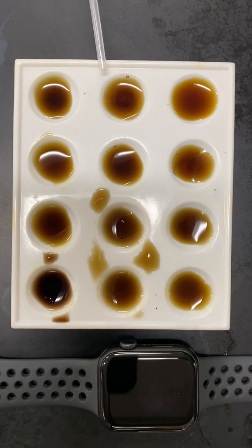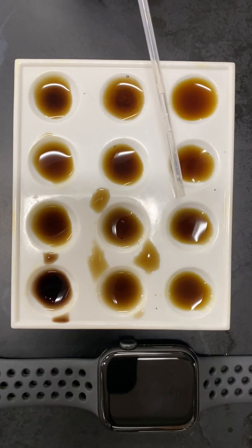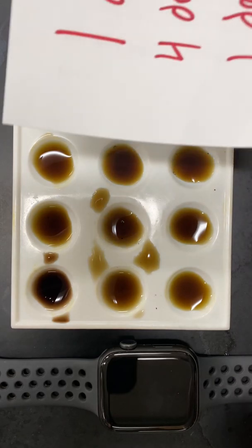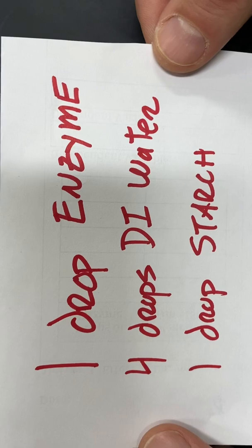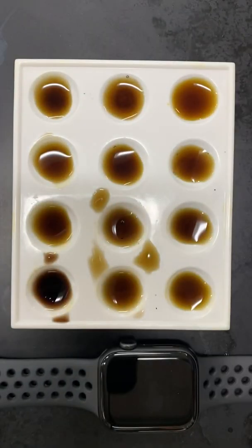This would be 210 seconds. This would be 240 seconds. This would be 270 seconds. This would be 300 seconds. And this would be 330 seconds. So in this scenario, you had 1 drop of enzyme, 4 drops of DI water, and 1 drop of starch. And that's what it should look like.